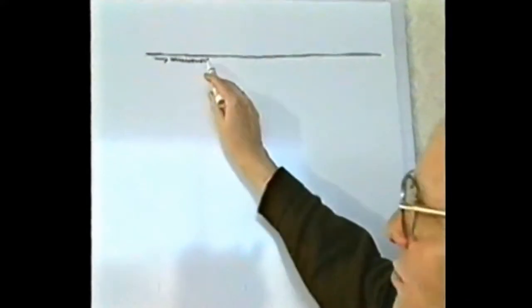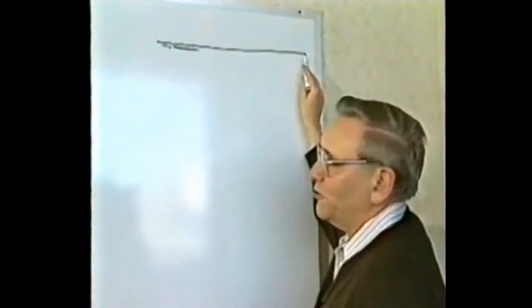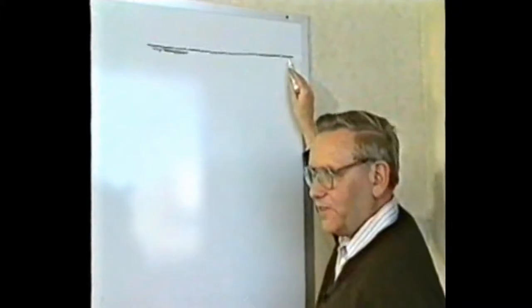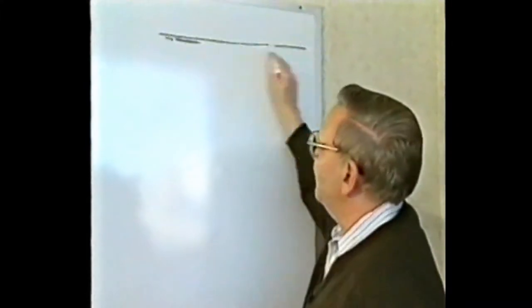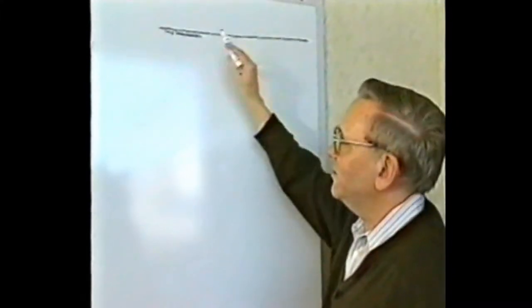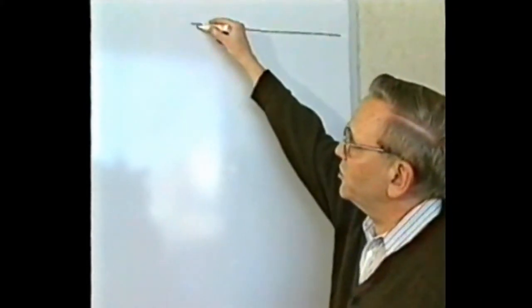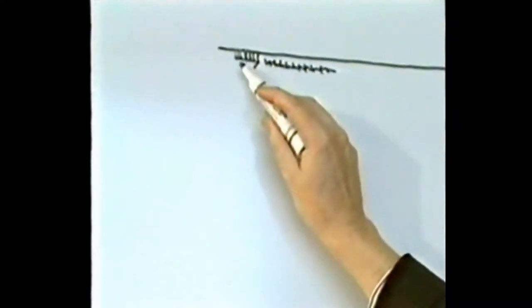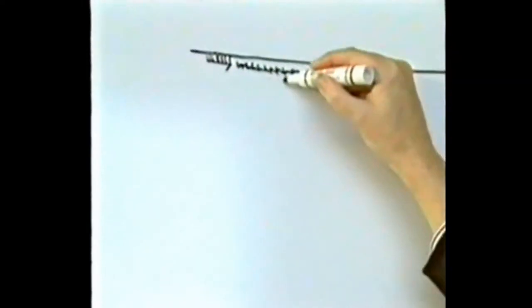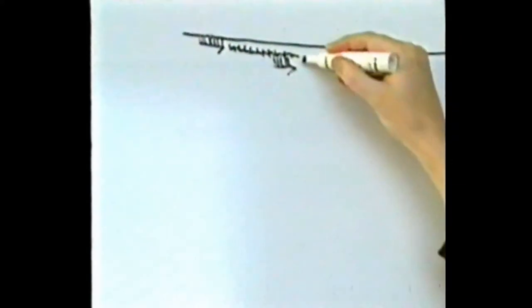DNA sequencing is capable of reading about 500 bases of sequence, but the template is usually very much longer than that. The problem is, how do you get the blocks of 500 that cover the whole sequence? The answer is that the template sequence determines the position of the primer. So if you construct a new primer, that now will go to a new site in the template. Now you can read a new 500 bases of sequence.